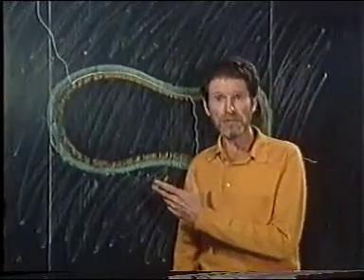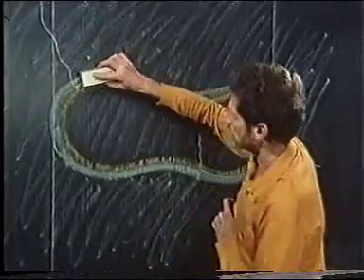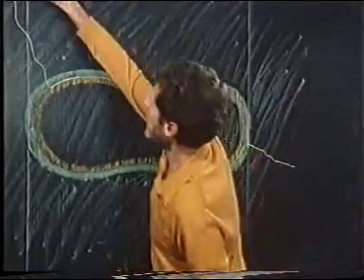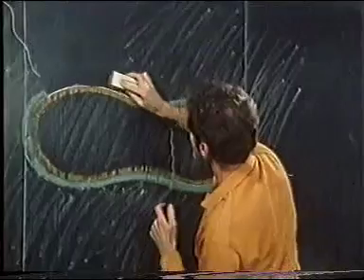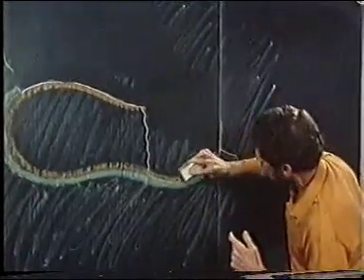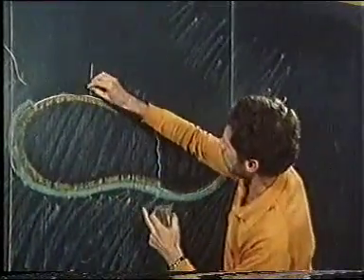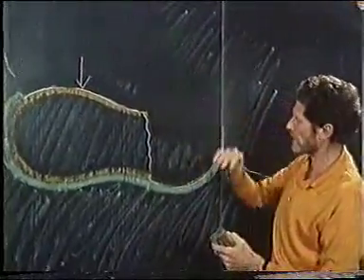For example, in the red blood cell preparations we were working with before, if this line represents the fracture through a cell membrane or through a cell, what happens is that half of the membrane, as well as the surrounding material, is fractured away. And what we're left with over here is the half of the membrane closest to the protoplasm. The half membrane closest to the extracellular space has been fractured away.